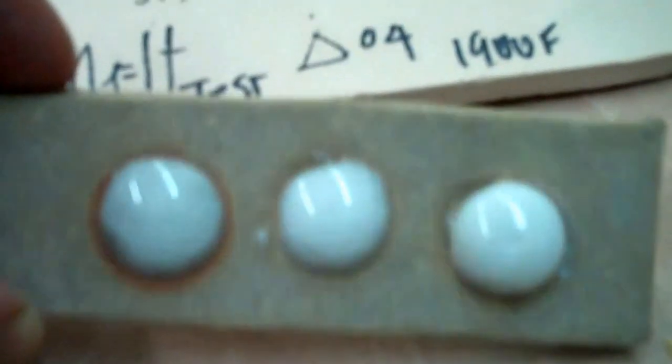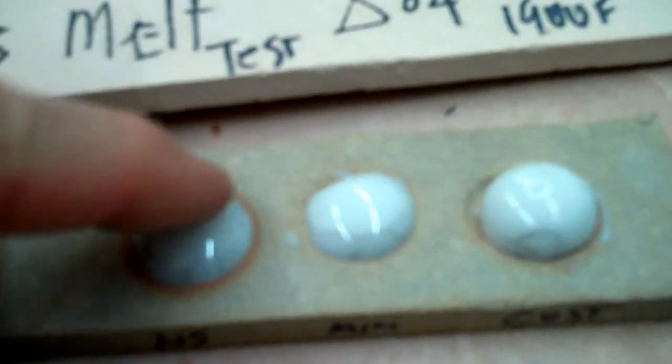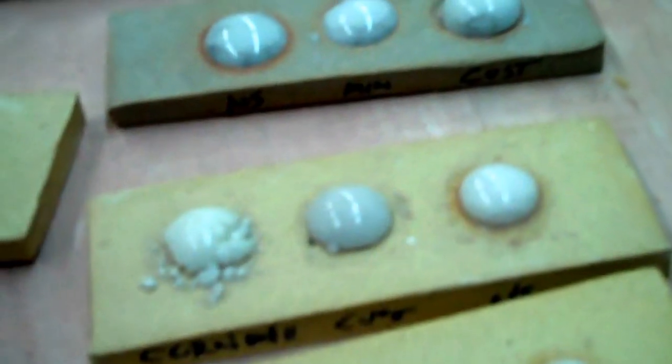Another method, like, so here's some feldspars that I did. You can see them melted. Here you can see how the sodium from the Nefsai flashes orange. Or like you can see here is a melt test of feldspars. Here is a Cornwall stone. It doesn't melt very well. Here is Custer feldspar. And here again is Nefsai. You see that flashing ring. So that tells you something about how feldspars melt.